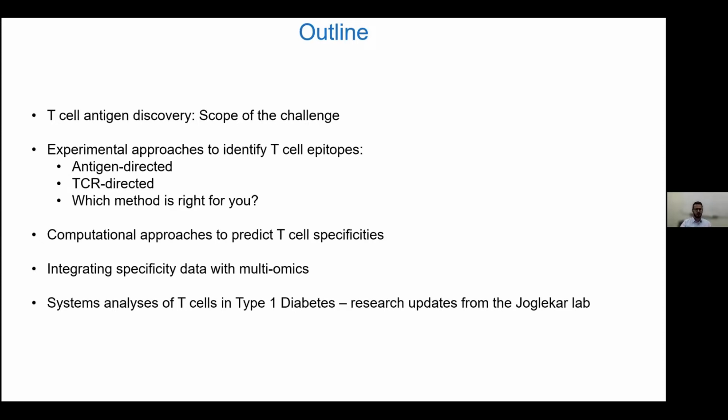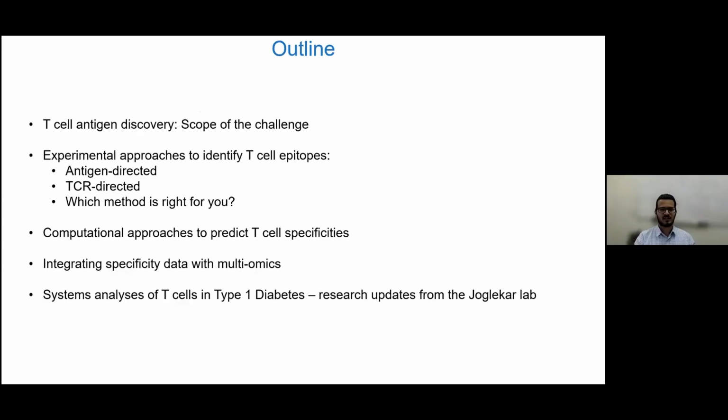Then I'll briefly talk about how we can integrate the data on T-cell antigen specificity with other multi-omic data sets. And then finally, I'll show a couple of brief snippets of how we're using these methods to study the role of T-cells in type 1 diabetes in our lab.